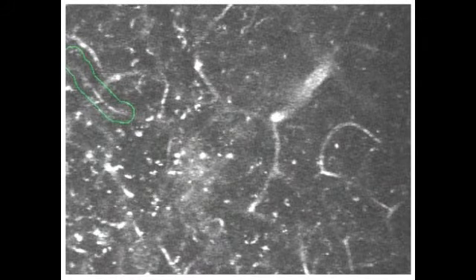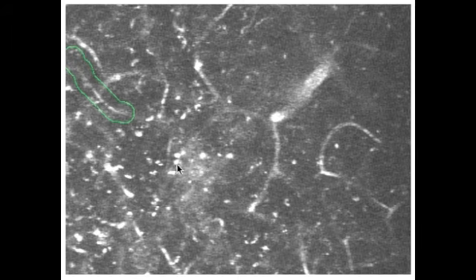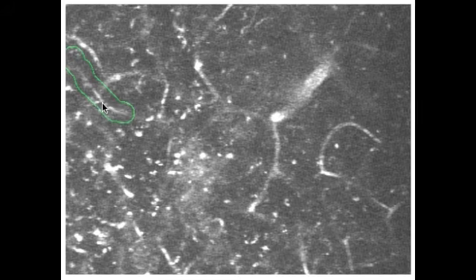Here we have an elongated outline. These tend to be easier to annotate because the vessel is oriented in the observation plane — basically horizontal vessels instead of vertical vessels that cut through the layers of tissue, which are a bit trickier. We can see there's a target vessel that follows the shape of the outline, and we just want to see if these little dark spots are actually moving through the vessel or stuck in those locations when we move the slider.